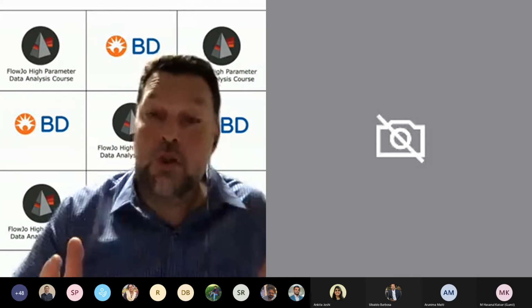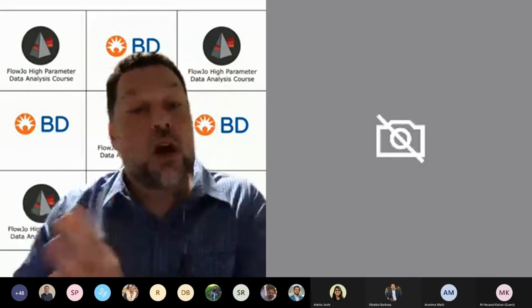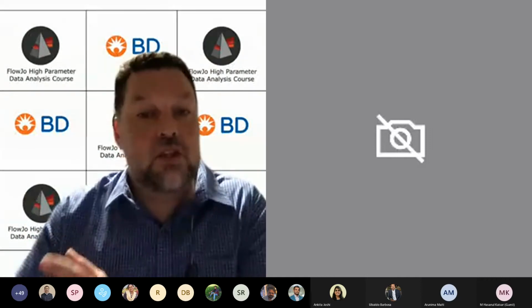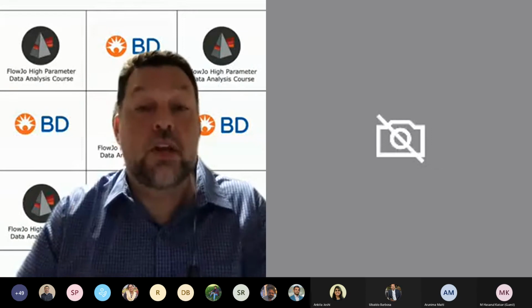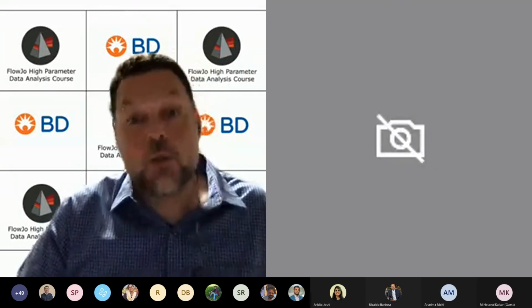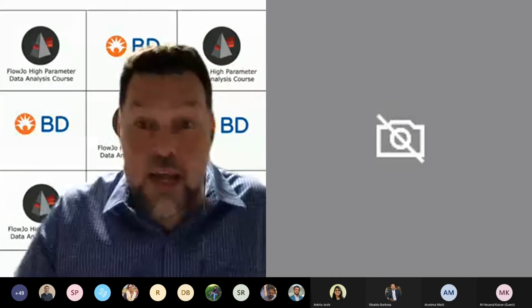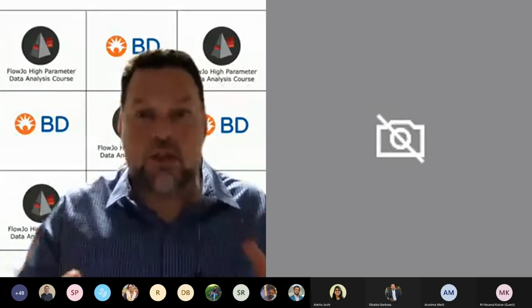We'll start with an intro that gives you all the basics, and then we'll go into the more high parameter workflows next week as the second part of our course, and we'll be giving out some data and an assignment that you can follow along to understand the workflow. But I'm going to lay the groundwork here today and hopefully give you a really detailed introduction.